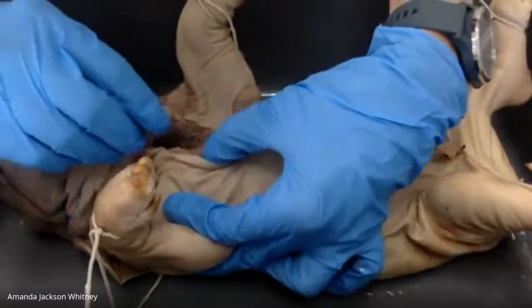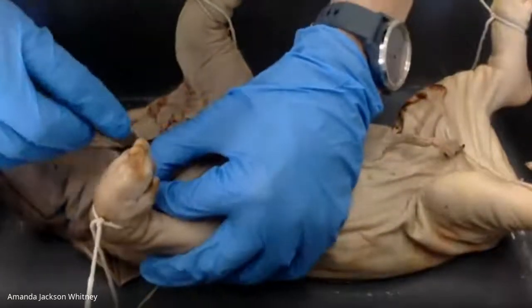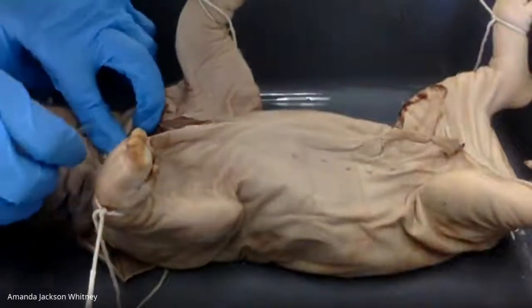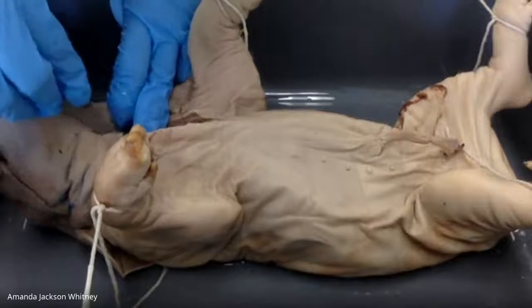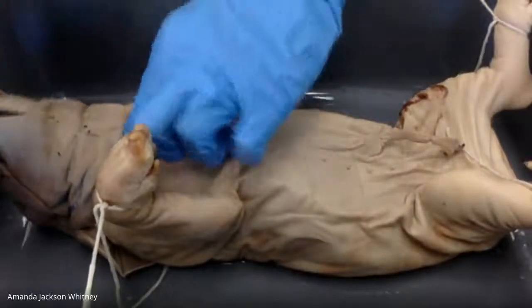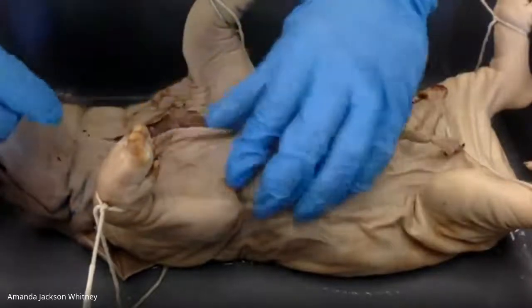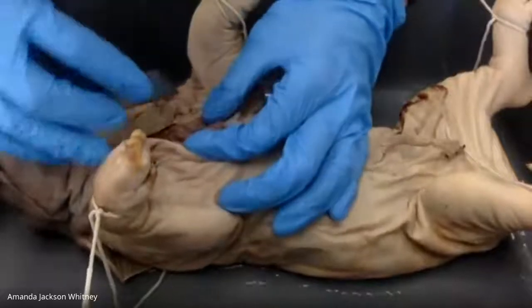We're getting close into Louie's thoracic cavity. Starting to see some glands. I'll point those out to you guys in just a second. Right now, I'm mainly cutting through muscle, fat, skin, obviously. A lot of muscles around this part of the body.